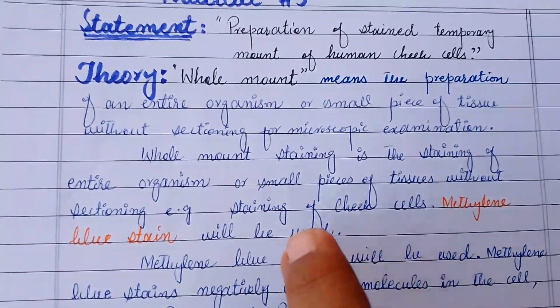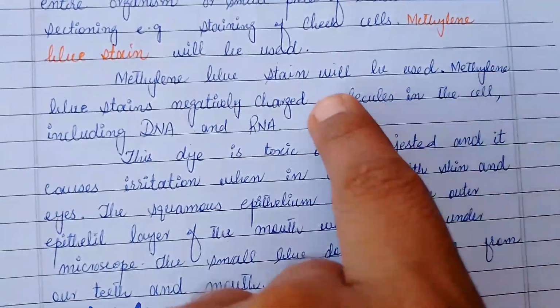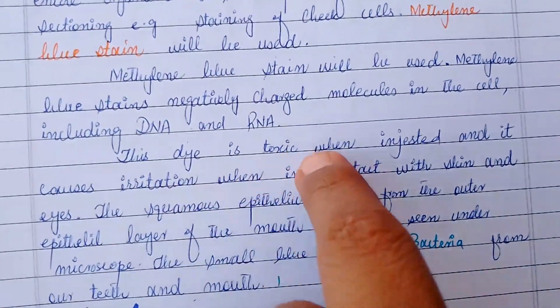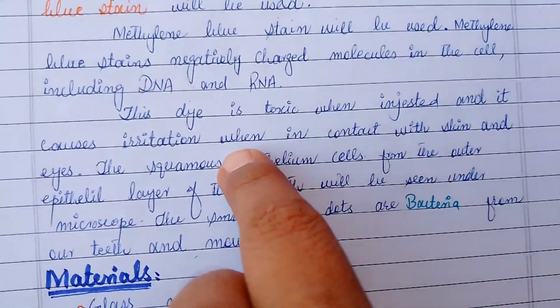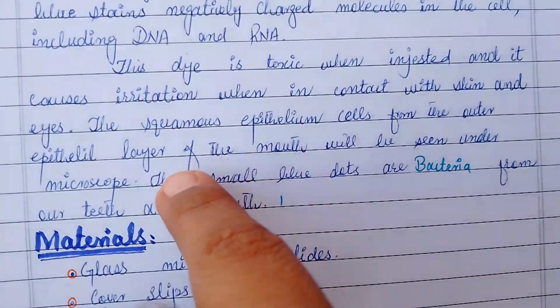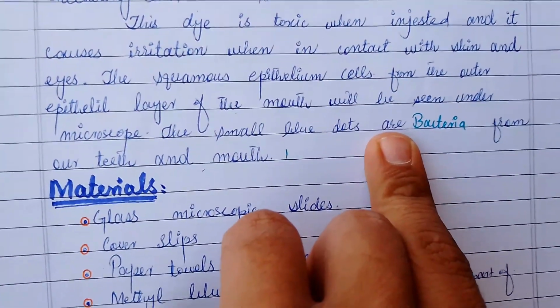Methylene blue stain will be used. Methylene blue stains negatively charged molecules in the cell, including DNA and RNA. This dye is toxic when ingested and it causes irritation when in contact with skin and eyes. The squamous epithelium cells from the outer epithelial layers of the mouth will be seen under the microscope. The small blue dots are bacteria from our teeth and mouth.